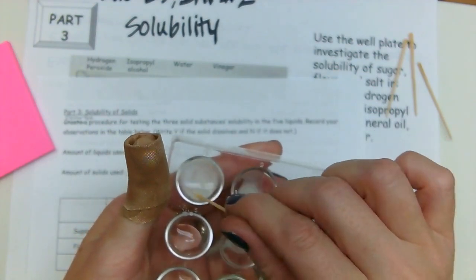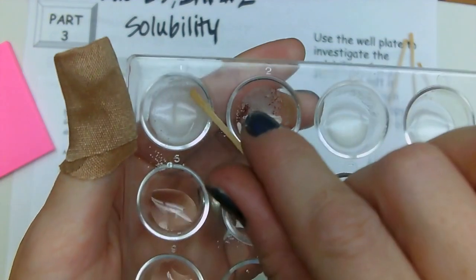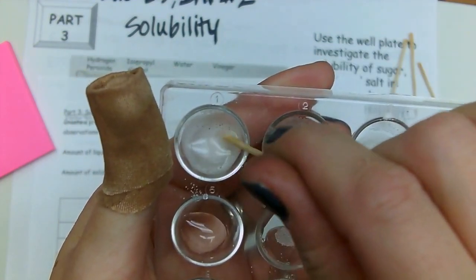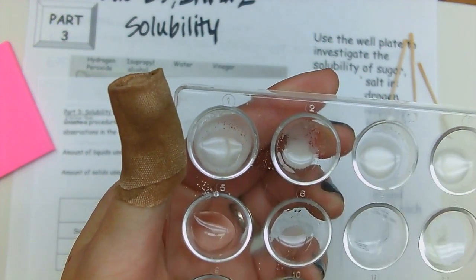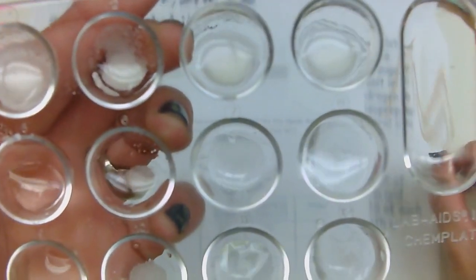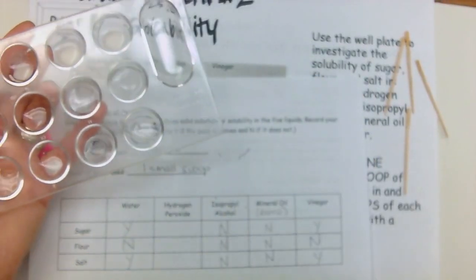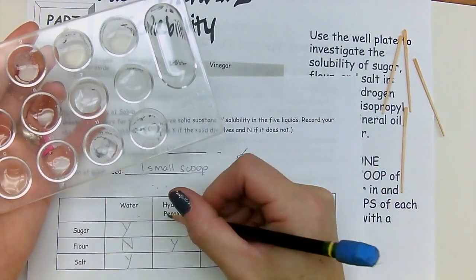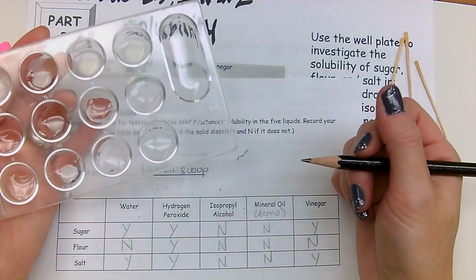That's crazy. So if anything, I would say the hydrogen peroxide, if you look, it did dissolve it. I mean, not all the way necessarily, but it turned it into this foam. So it's changing the flour in the hydrogen peroxide. So let's take a look here. I'm going to say hydrogen peroxide dissolved flour, and it dissolved sugar, and it dissolved salt.